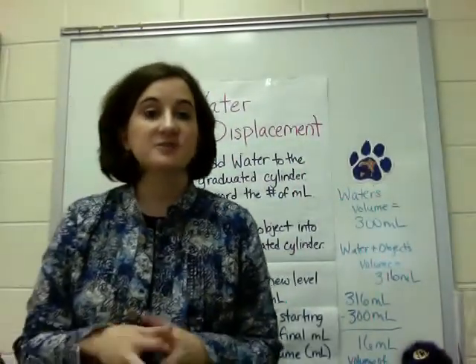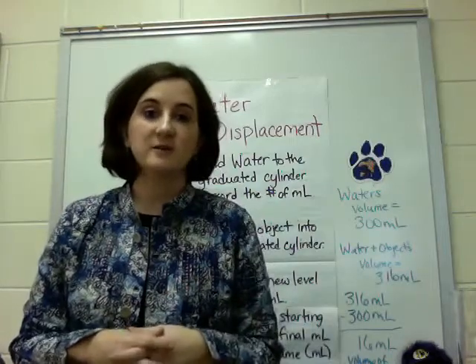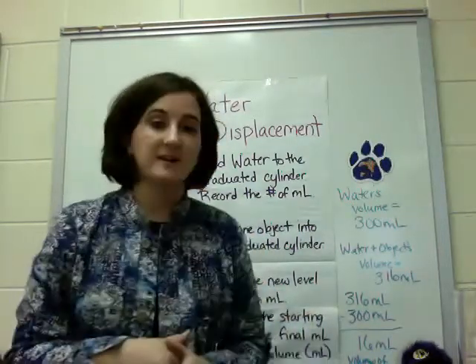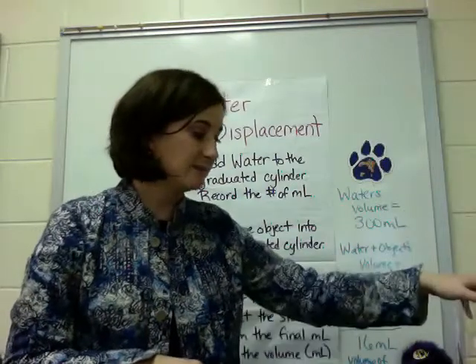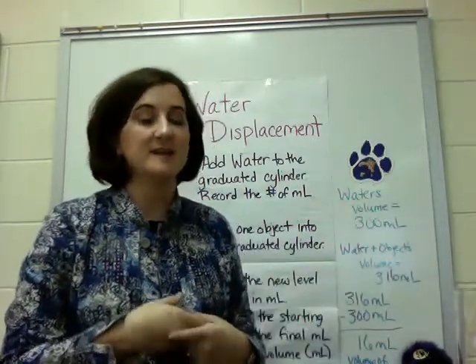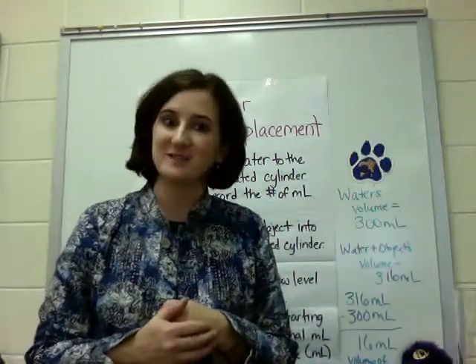Now I would recommend you pausing, rewinding, rewatching the video because tomorrow in class you will be asked to find the volume of an irregularly shaped object. You'll have to be able to read the graduated cylinder. You'll have to be able to correctly place the item into the graduated cylinder. You'll have to be able to then calculate its volume. So take a moment, rewatch the video, and we'll see you tomorrow in class.